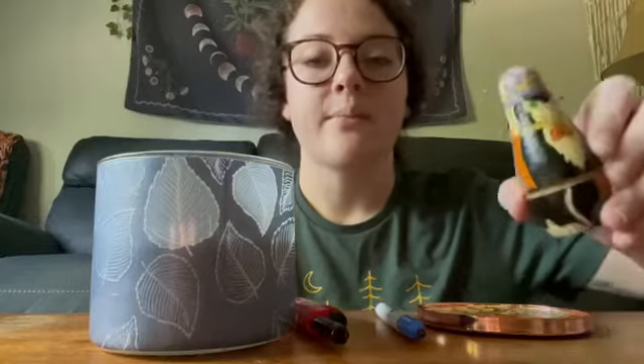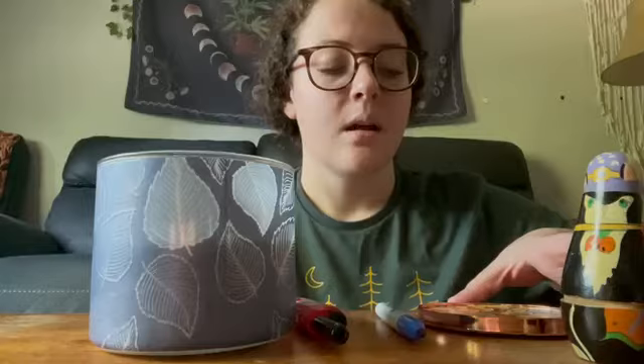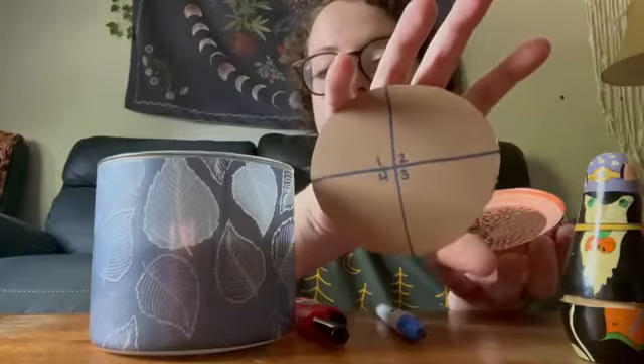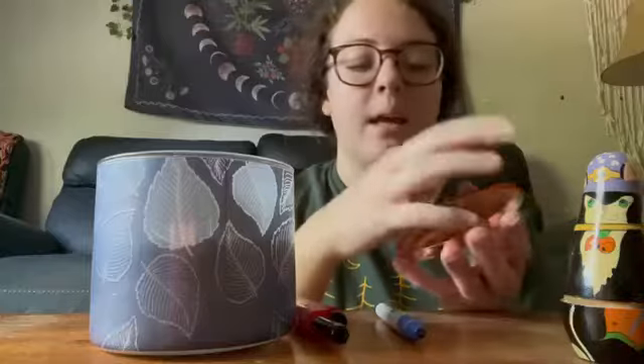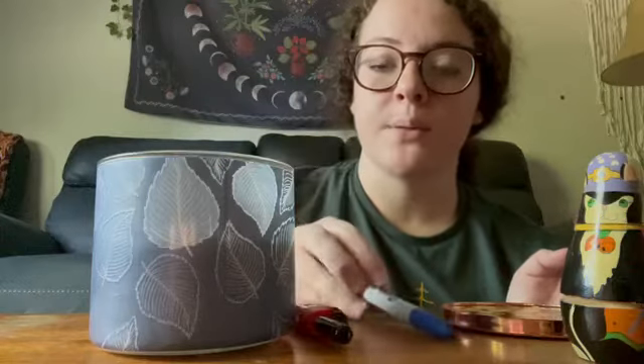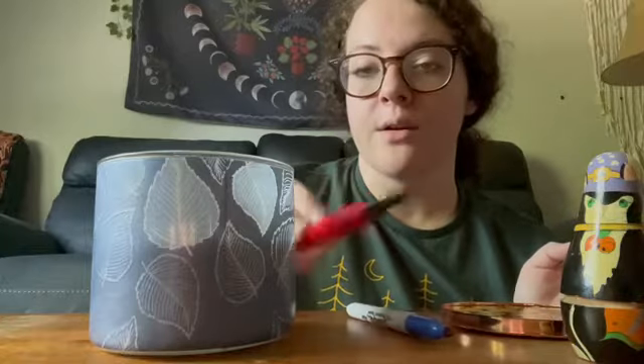Hi, my name is Elizabeth Furches and this is my lab skills video about the quadrant streak plate. So first I have my test tube, my petri dish with my agar plate that is labeled for each quadrant and it has my name on the back, my inoculating loop, my striker, and my Bunsen burner.